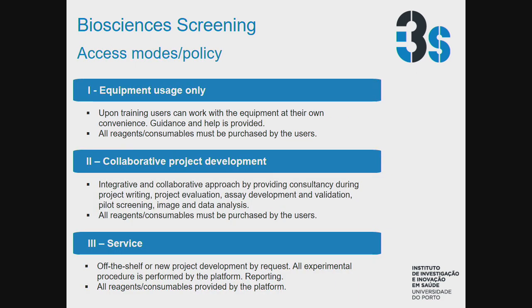So there are three ways that you can access the platform. You can do it by equipment usage only. So upon training, everyone can use the equipment at their own convenience.